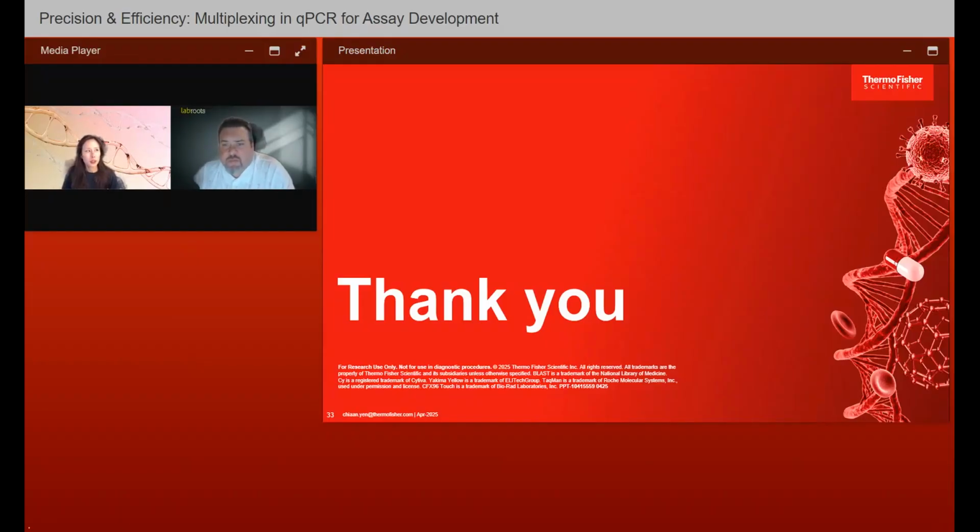So not that I'm directly aware of on our website. For me specifically, I use NCBI BLAST a lot, and you can also use software where you can pull the sequence of your gene of interest and the pseudogene pretty easily from databases like UCSC or NCBI, right?